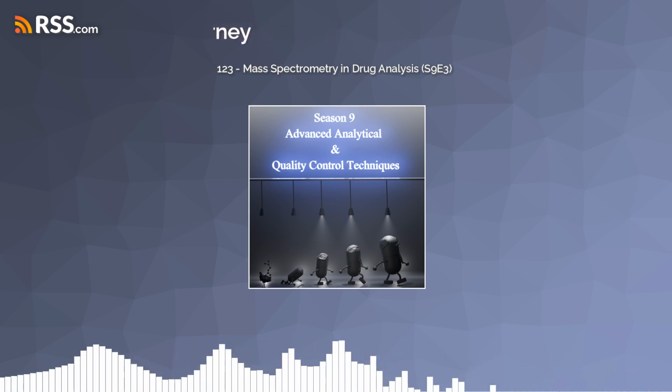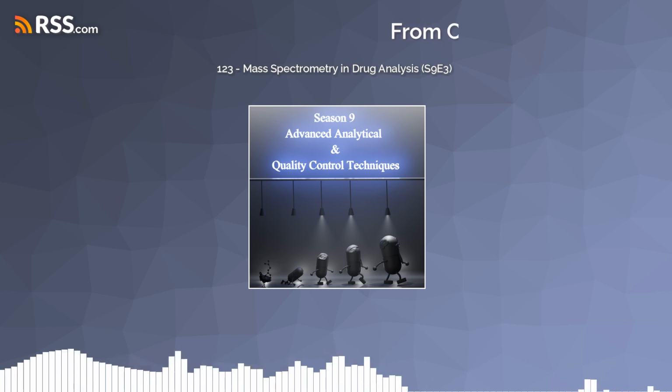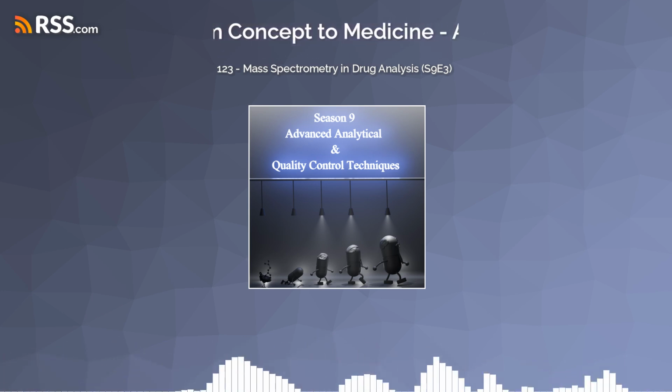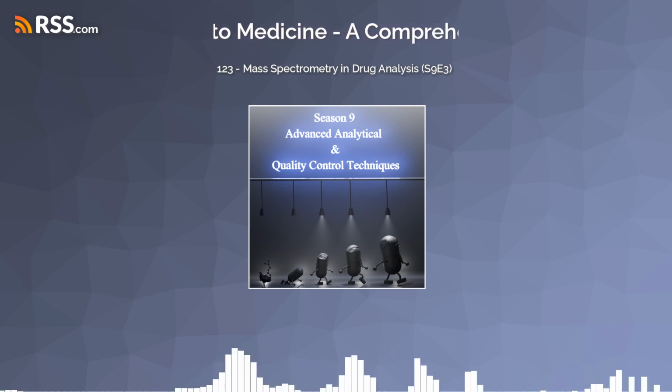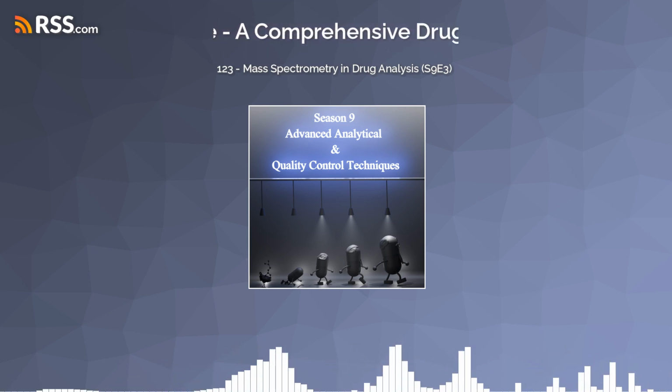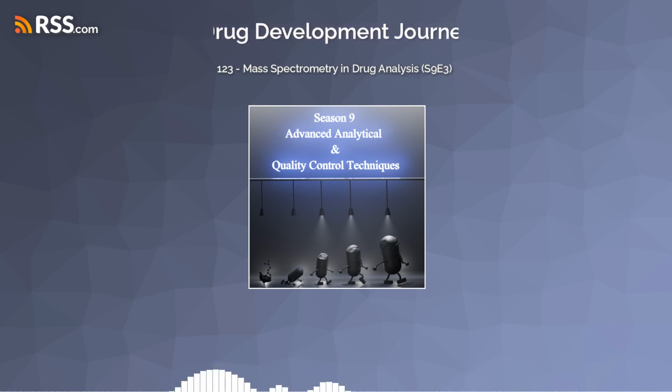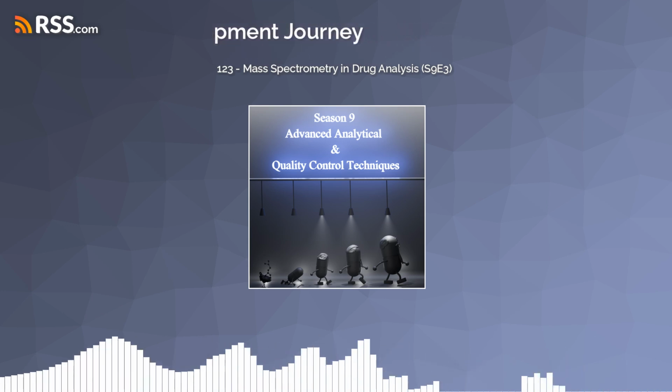Now, you often hear the words resolution and sensitivity when talking about these instruments. What do those really mean? Okay, imagine you have two identical twins, but one has a tiny, tiny birthmark. A high-resolution mass spectrometer is like having superhuman vision that can spot that minuscule difference. So it's about seeing those really fine details.